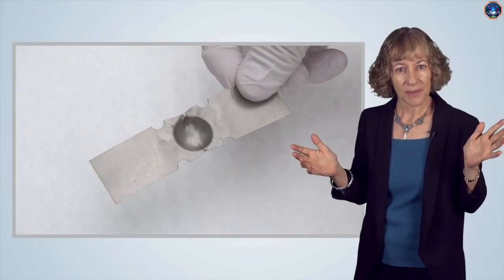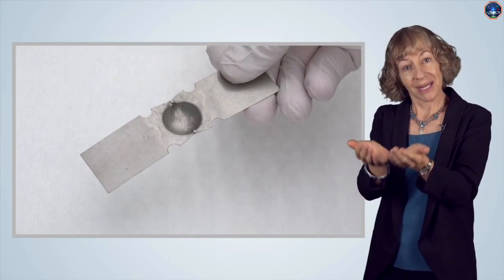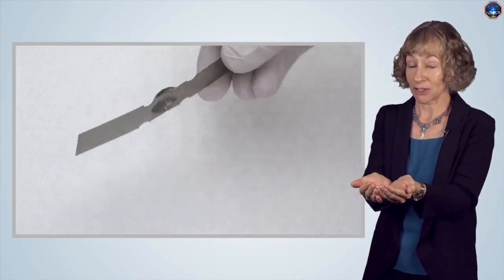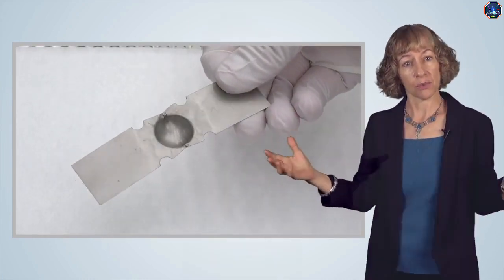Why tungsten? If we want to melt a metal, its container, the boat, must remain intact during heating. That is, it shouldn't melt along with the source. And we need to conduct a large amount of current through this boat as well. So we use tungsten boats because tungsten has a higher melting point than our source metals, and it's very electrically conductive, allowing resistive heating to occur.